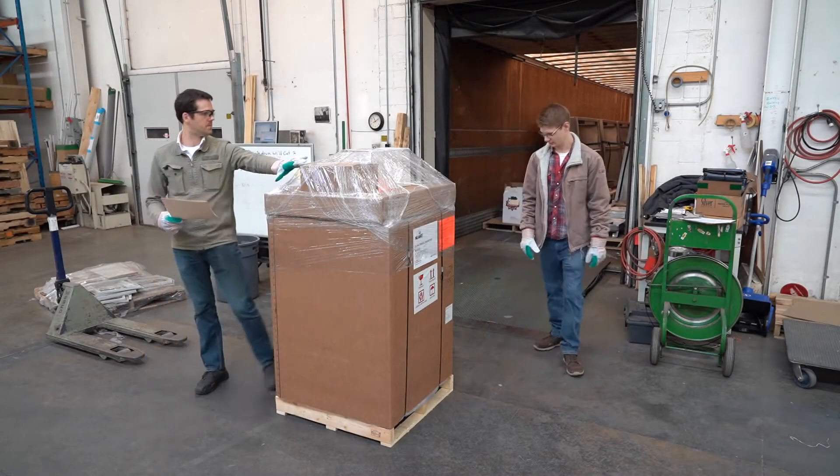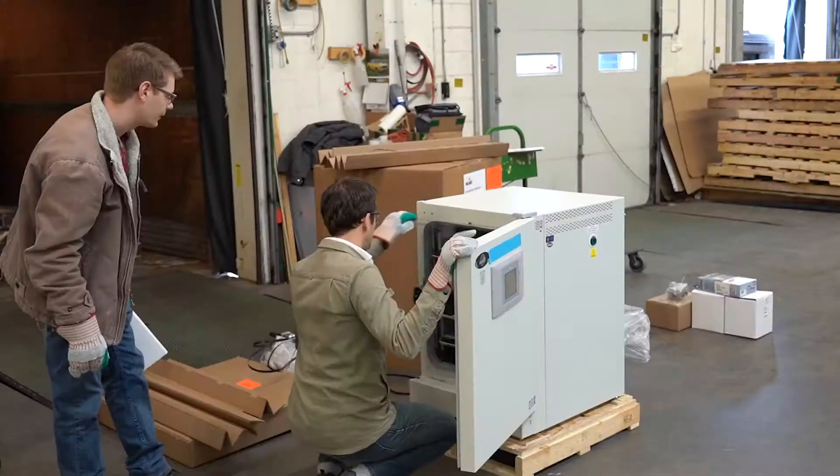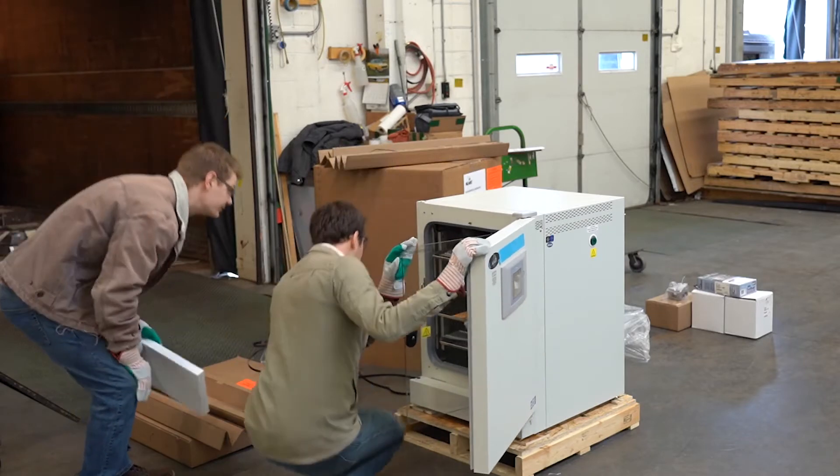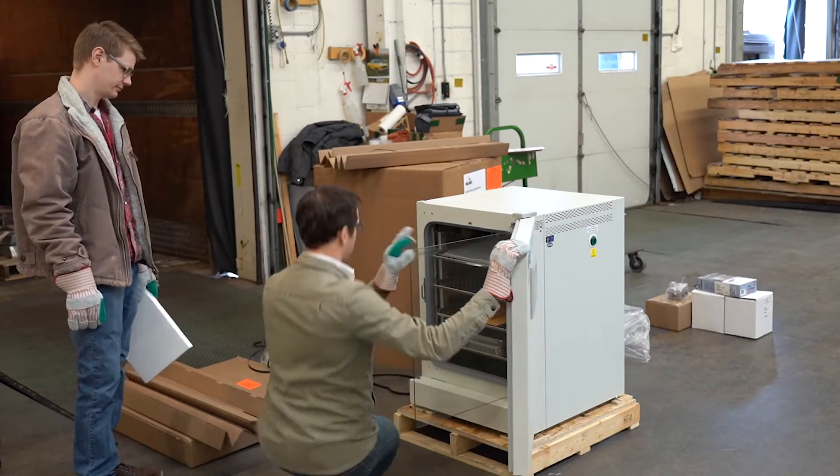Start by inspecting your incubator when it arrives. Remove the packaging to check for hidden damage. Note any damage on the bill of lading, take photos, keep the packaging, and report it to your forwarder.